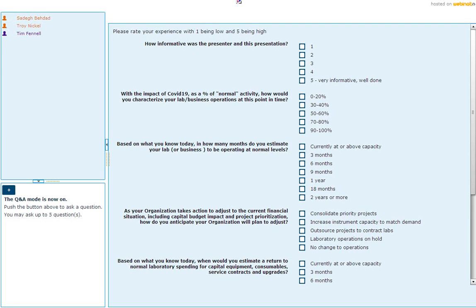And also with that different variant that I mentioned with a heated microscope, it will have a lower resolution, but you can look at shrinkage and expansion in 2 dimensions at the same time. The temperature performance on that option would be room temperature and up. But in this one, we can also go through TG and look at the thermal expansion. But anyways, in the TMA, you have a wide array of grips, and you can apply different forms of deformation to your sample and measure your softening point, TG, and thermal expansion coefficient.